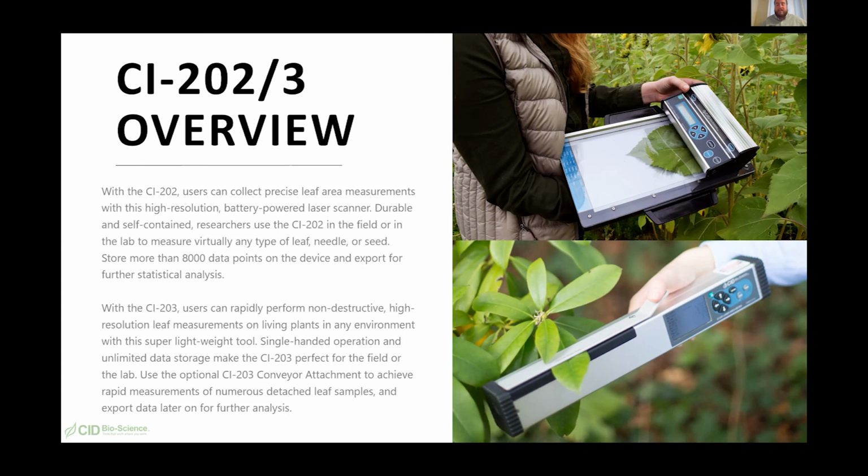I will say that for the CI202, the scanner is looking for a change of 1 millimeter or less. So if it's scanning and it sees that the width has gone from 1 millimeter down to something less than 1 millimeter, then that's when the scan head is going to decide to stop scanning. So when it says it's zero width, that's when the scan head stops scanning. Sorry, 1 millimeter is every time it takes a new measurement for width.